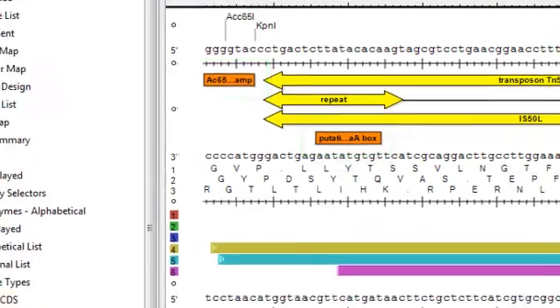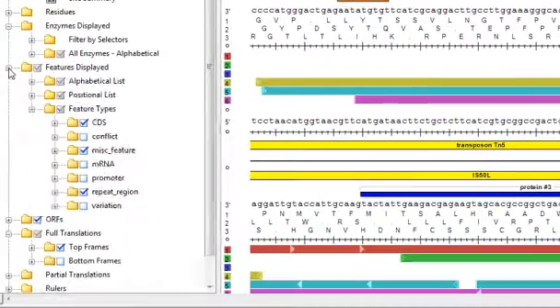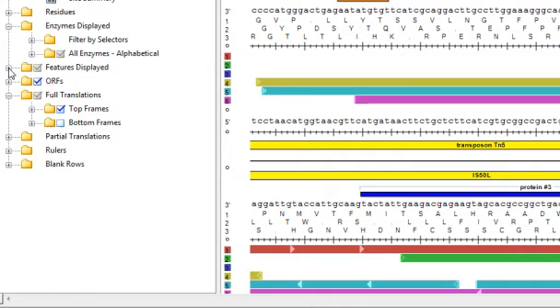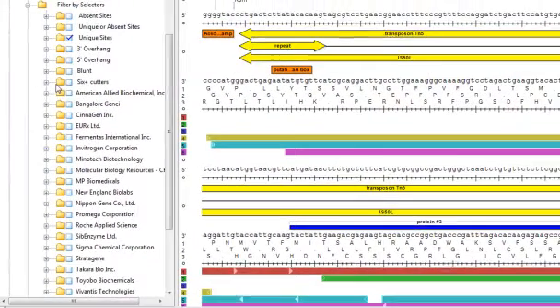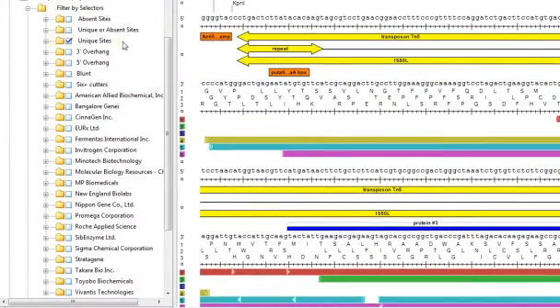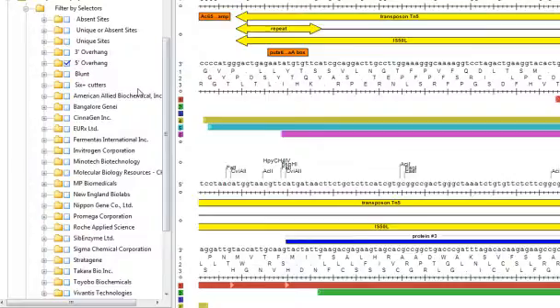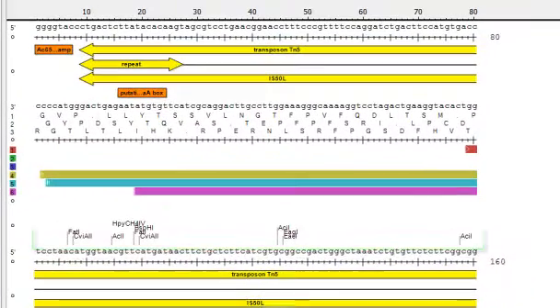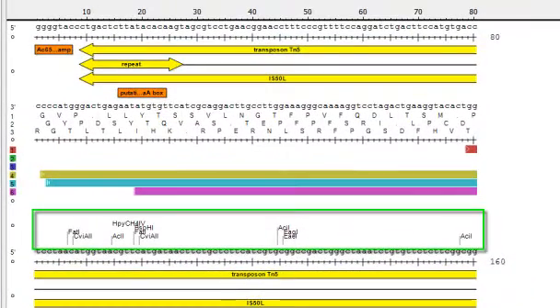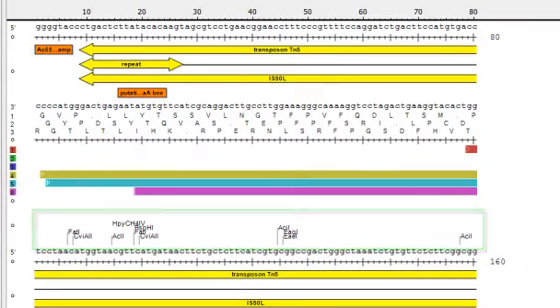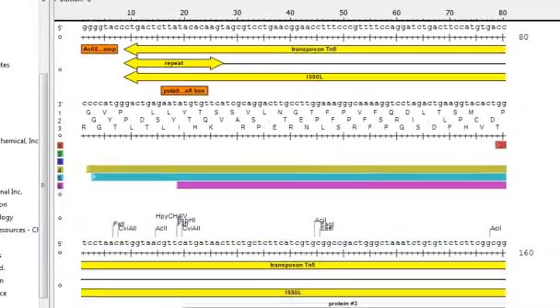Enzymes can be displayed on your sequence in several different ways, and this is true for every view. One way is to filter enzymes by using a selector. And as you can see right now, I'm only displaying unique enzymes. But if I uncheck that box and select 5' overhang, for example, now I'm only displaying enzymes that leave a 5' overhang when they cut.